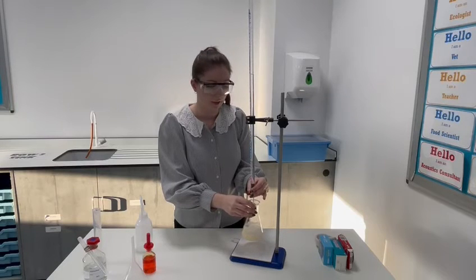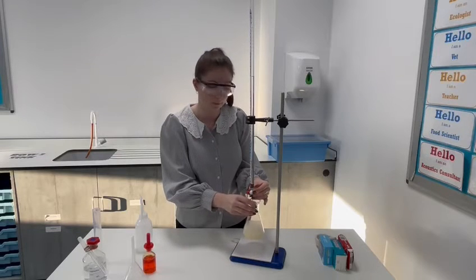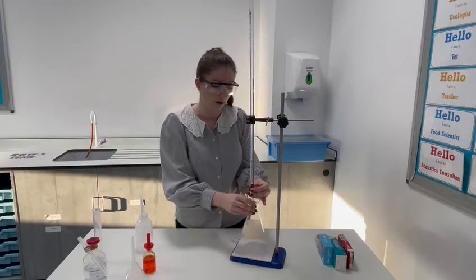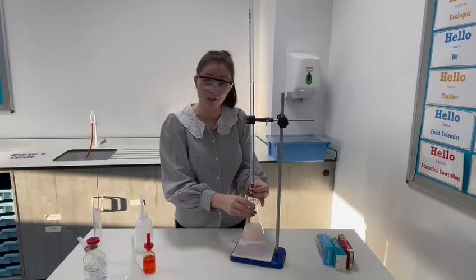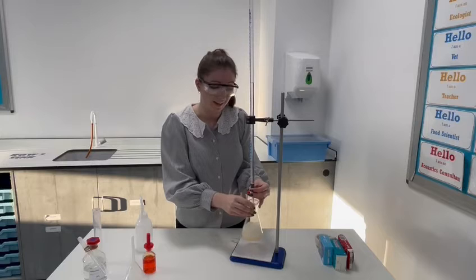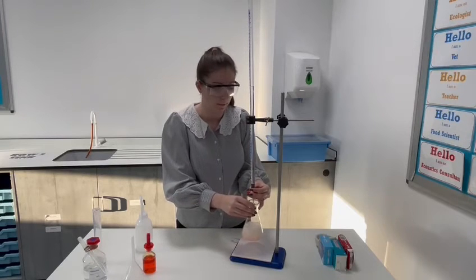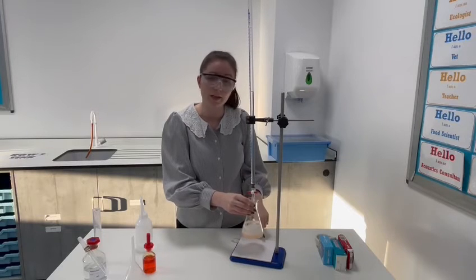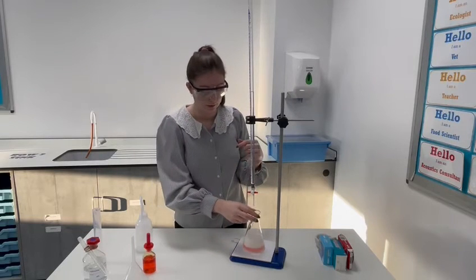This also provides a valuable chance to discuss with students why it's important that we approach the endpoint slowly. So why, as we see that colour change stick around for longer and longer, we should add the acid in small volumes until eventually we want to be adding drop by drop. So again, linking to accuracy and what impact that has on any results and any conclusions that we might make. You can also see that I've placed a white tile under here, just as we would in a titration, to make that colour change nice and obvious.